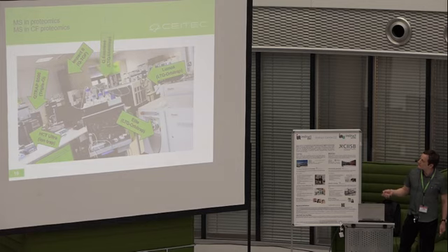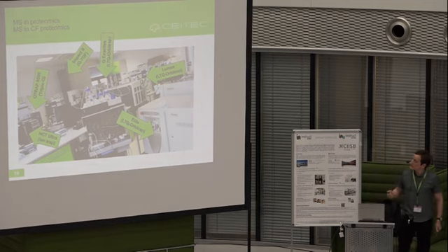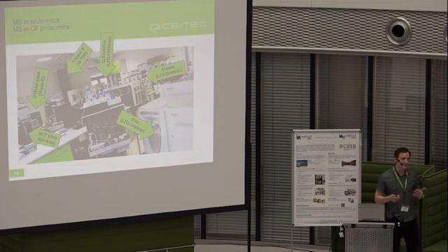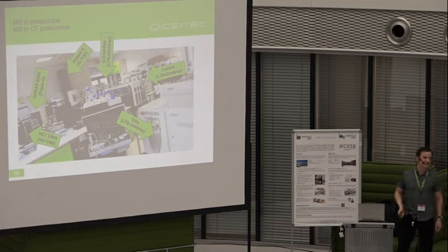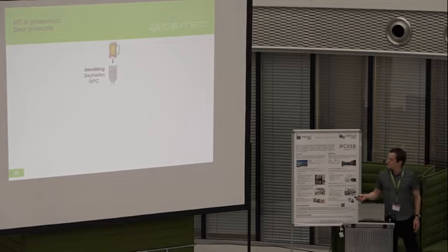We have also another Orbitrap instrument recently installed, which hasn't got such rich ion optics, but it is really very fast. It is excellent for large-scale studies where in a single LC-MS run, it can identify and quantify over 1,000 proteins. To see what we can do with this instrument, I selected two examples of recent studies conducted in our laboratory. So, a typical Czech sample, a beer, was desalted, and then it was treated as a common proteomic sample.